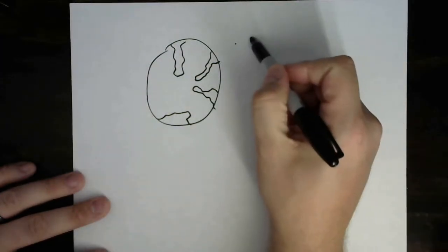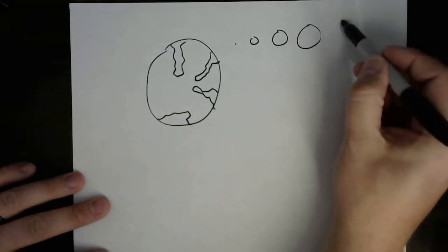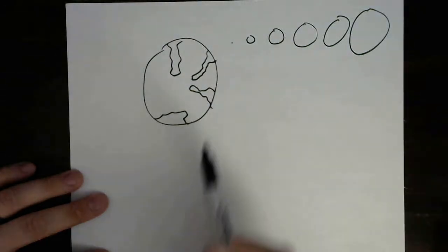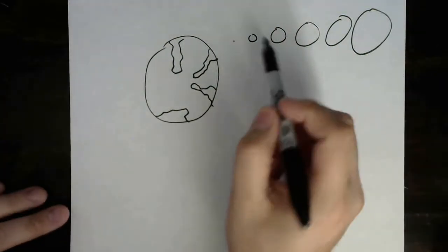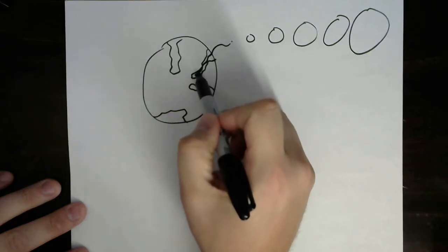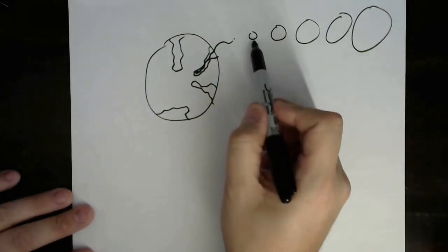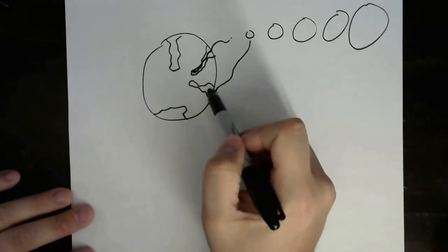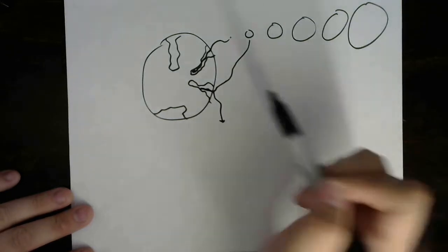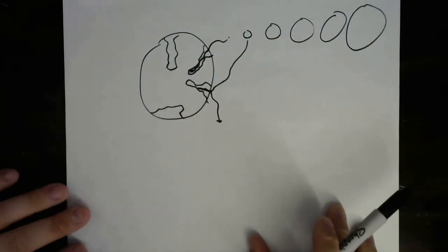And so if we have a range of sizes of particle or analyte, these things can diffuse in solution past this particle, while these small things are going to have no trouble diffusing all the way in here, right? But larger particles, like this one, for example, may be able to get into part of the pore, but there's going to be some restriction at which their only option is to come back out. Again, all just by diffusion, all just by random walk motion in solution.